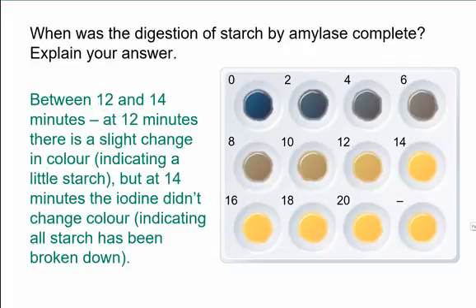So that's the starch and amylase experiment explained, and I know that our Year 9 students got some good results here.